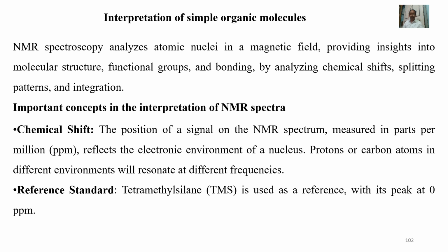NMR interpretation plays a pivotal role in molecular identification. In interpreting NMR spectra, the structure of an unknown compound, as well as known structures, can be assigned by several factors such as chemical shift, spin multiplicity, coupling constants, and integration.